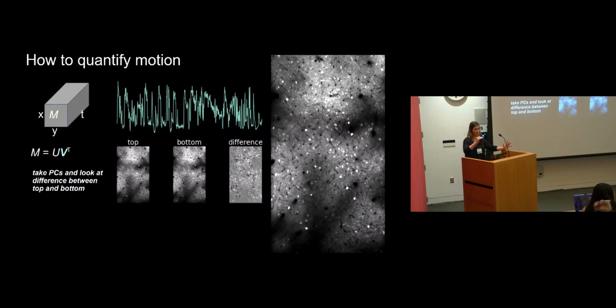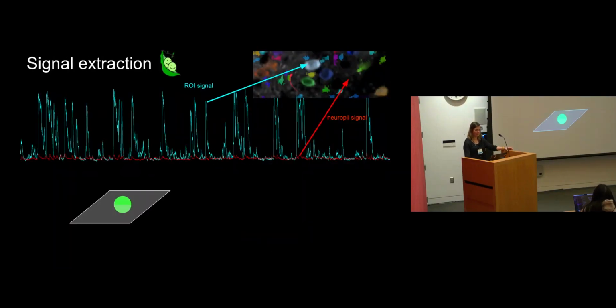Yeah, no. So basically, in our calcium transients, ideally things look like this. Like you get an input of a signal. We very rarely see this overall suppression of the signal we're imaging. So if you see this decrease in overall brightness, it's a pretty big red flag that your cell is moving out of your field of view. I've seen some people in zebrafish say they do see some negative signals, but in mice, I've struggled to see it. So if you see negative deflections, you should be wary that you might have movement of your plane in Z.